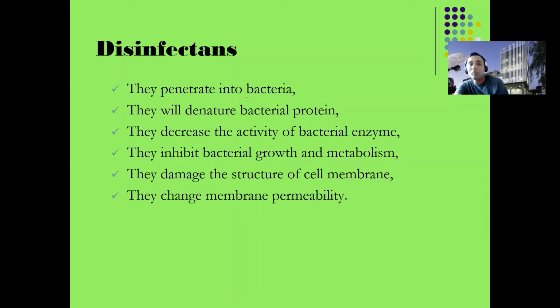So we have to use molecular grade detergent like Triton X-100 or Tween 20. These are molecular grade detergents, which do not have any kind of contamination, because the detergent you are buying itself may have some contamination, right? So that is one thing. Now, what the disinfectants do depends on the type.